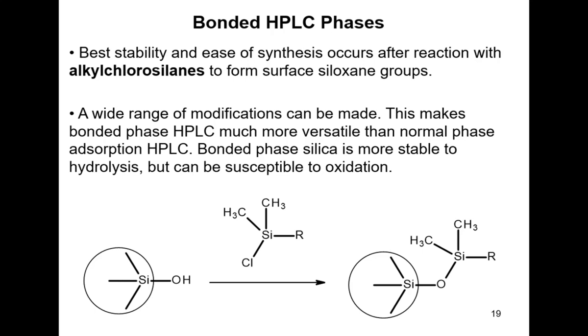It does bring in an additional issue. If you're adding hydrocarbon chains, you can get slow oxidation of the hydrocarbons just from the dissolved oxygen in the mobile phase. It can cause free radical oxidation reactions, similar to what happens in lipid molecules in biological systems.